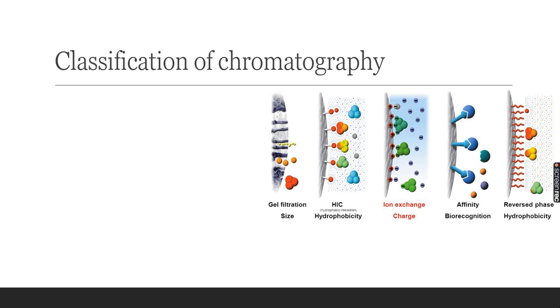In HIC, that is hydrophobic interaction chromatography, hydrophobicity is the key player. Reverse phase is also very similar, and the fundamental procedure remains the same. In reverse phase the degree of interaction is much higher compared to HIC. In both categories, the hydrophobic force is bringing them together, so hydrophobic interaction is the mechanism. Ion exchange is a pretty simple one. A positively charged binding site on the adsorbent is going to interact with a negatively charged analyte.